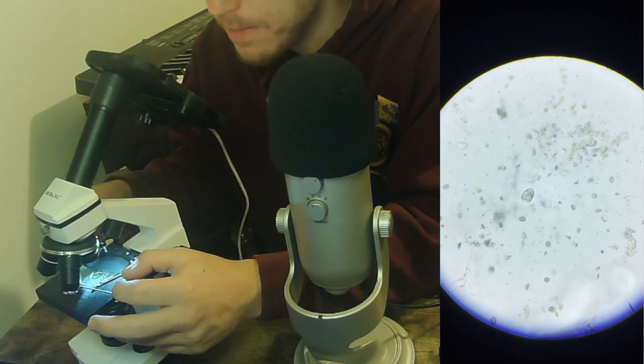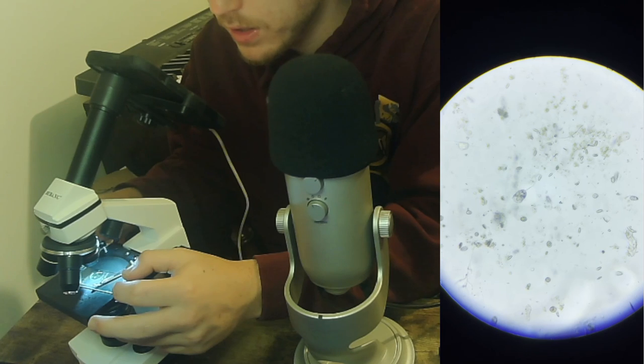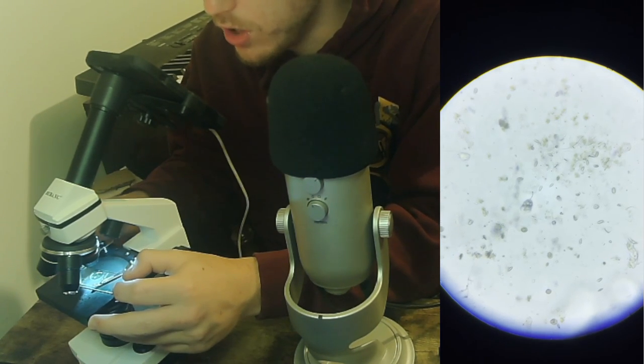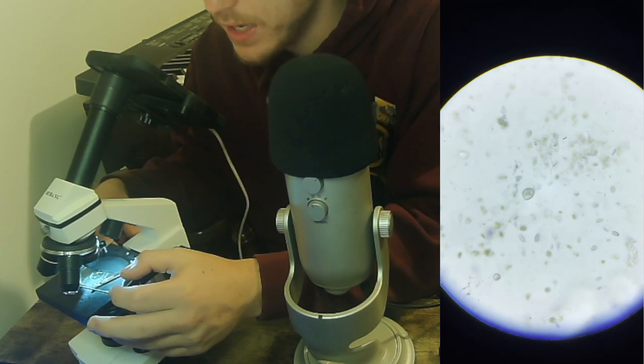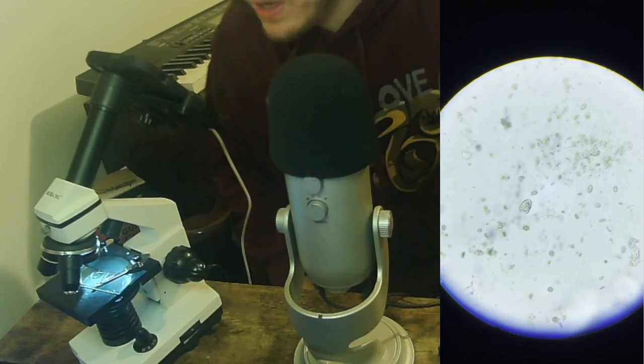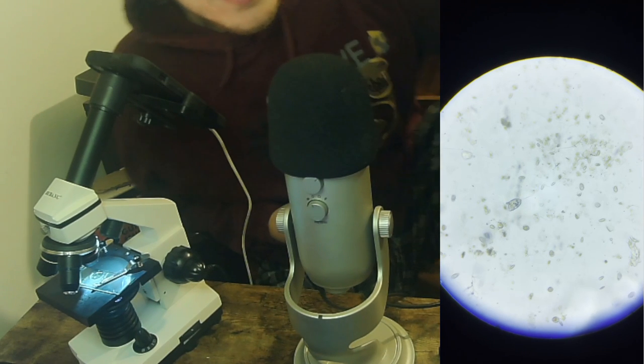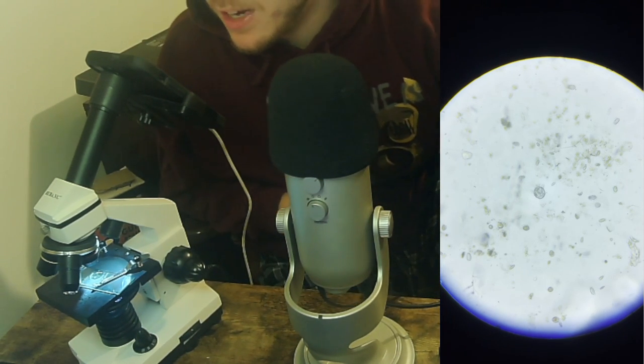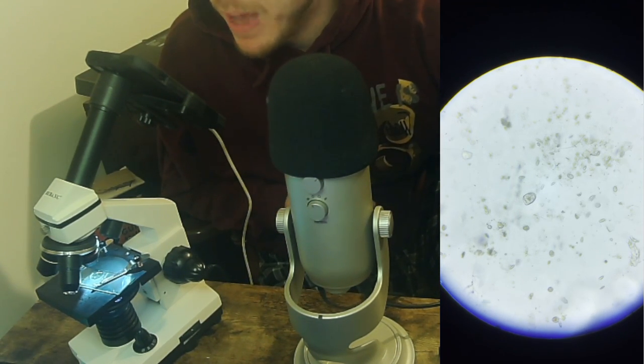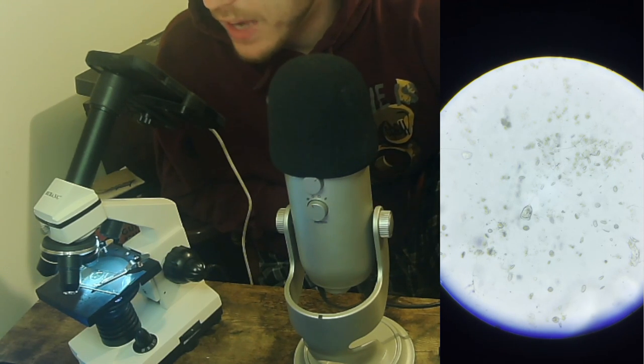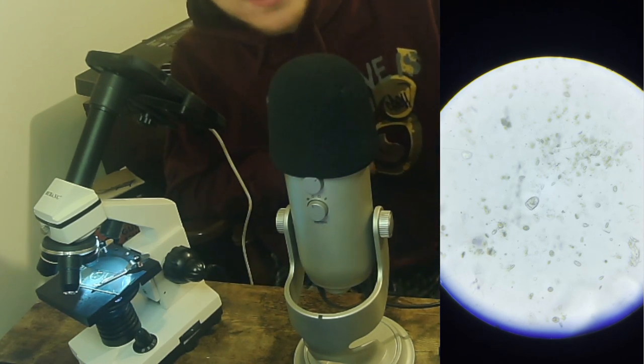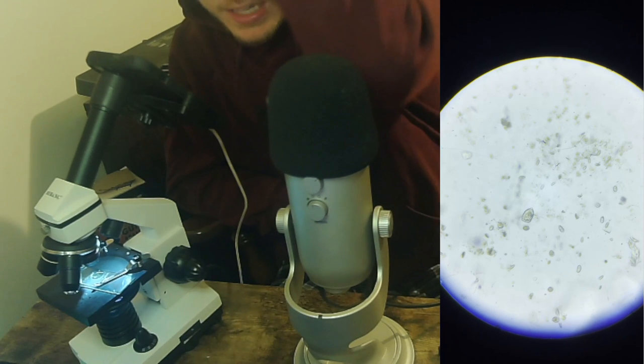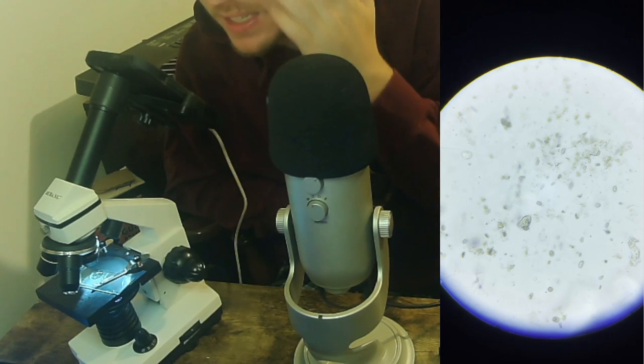Oh look at that! That right there is from the family vorticella. It is holding on, it has a stalk. Let's go ahead and zoom in on that guy because that's really interesting. This guy right here in the middle, and it's on a stalk. It almost looks like a piranha plant, like a Nintendo piranha plant. And look how it teleports back! It moves so fast that you can't even catch it. Once it reaches its max, it sort of snaps back to default like that. It looks like it lagged, like the video lagged, but I'm watching it in real time. That's actually what it looks like.